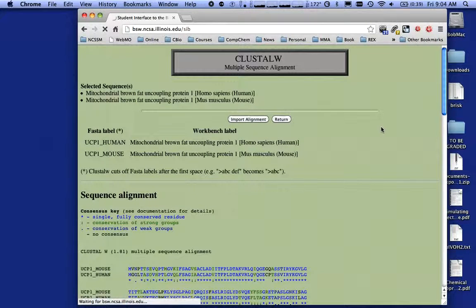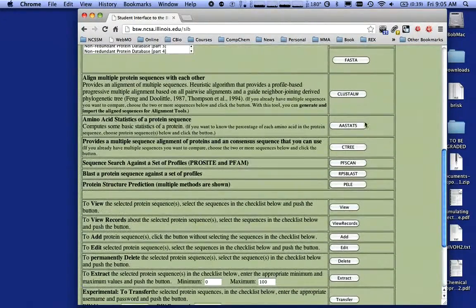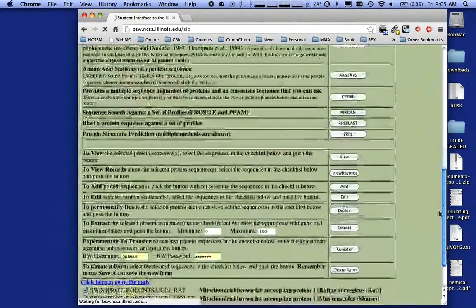That's what I would do to compare two sequences to each other. More typically I want to compare multiple sequences to each other, so I'll wait for it to get back to my protein sequences page. I'll scroll down and click on all six of my sequences, then go up and do a Cluster. Some other tools I might use: I can click on a single protein and look at amino acid statistics, which is often helpful.